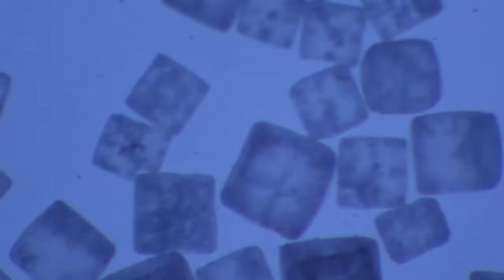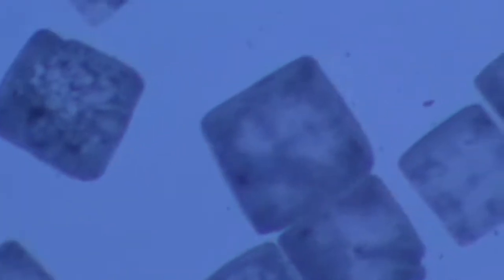So this is the advantage of this one that has the backlight on it, because this is a view you'd get in a regular compound microscope, but now you can do it with a dissecting scope and have more control over the zoom. And they all have different little diffraction patterns. Almost look like dice with little dots, like that one. That's a trip.